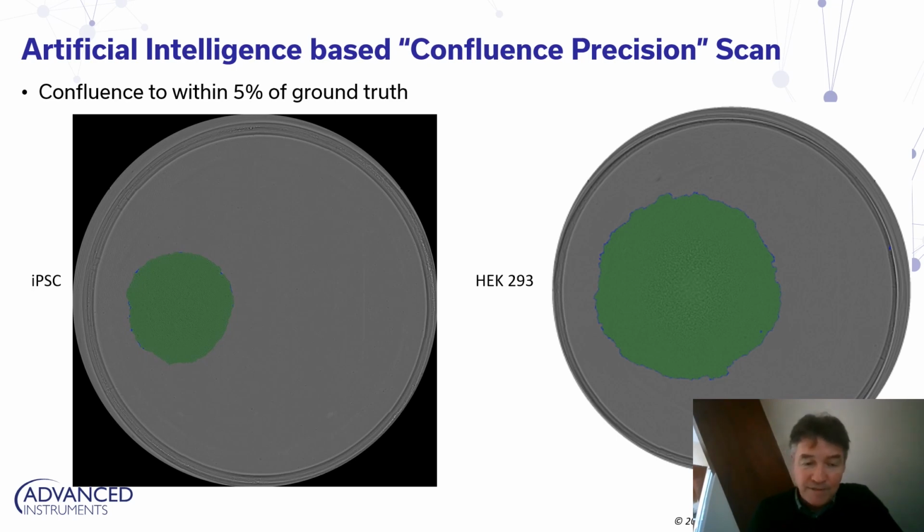In the case of the iPSC colony, this allows us to very accurately gauge the optimum time point for expansion without any risk of loss of pluripotency or other negative factors when deciding when to expand.